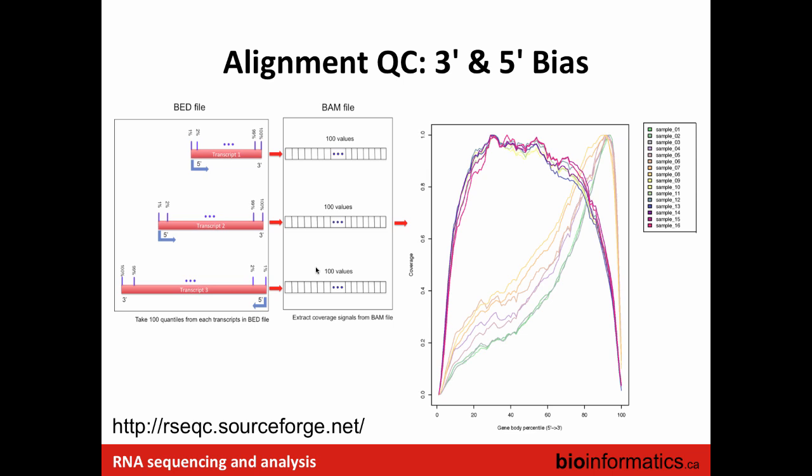Do you observe a similar pattern with ribosomal depletion? If the ribosomal depletion is good, you should get a pretty even distribution and it shouldn't bias you towards one end of the transcript.